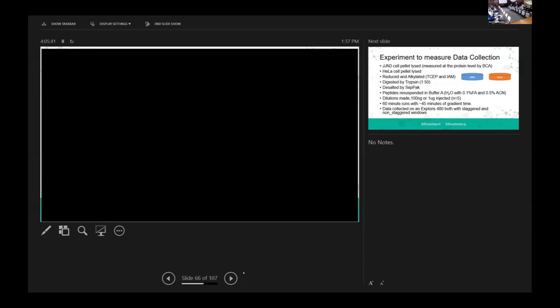They look at those, they know their biology, and they say, this is an exciting result, and would ideally come back to you and say, I just want to double check. How did you come to this? And maybe even ask for a chromatogram range. That's a great point.